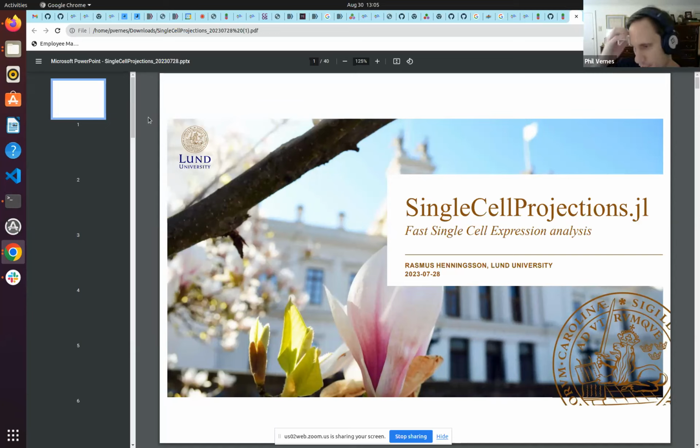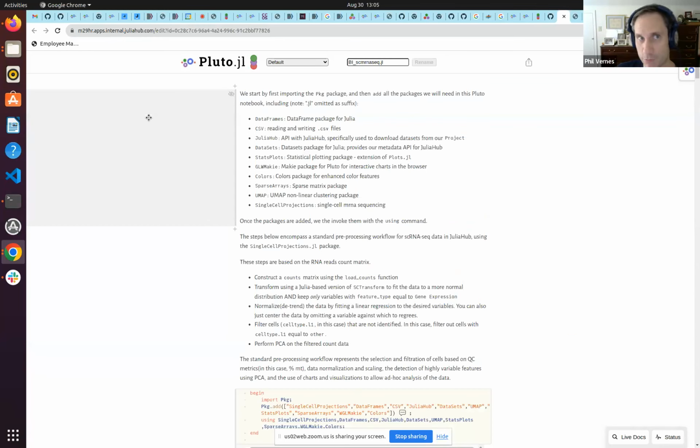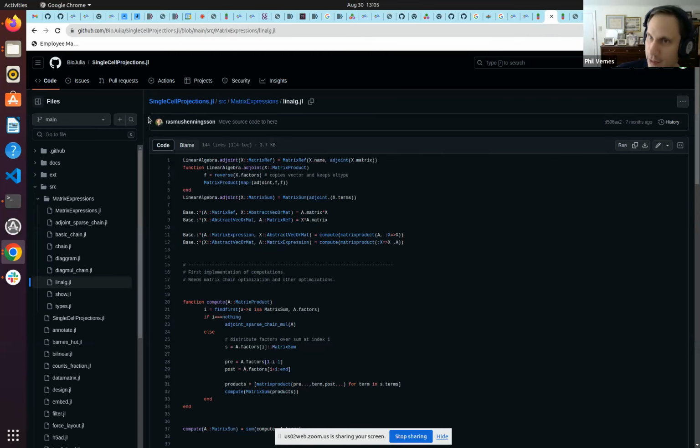So what's going to happen in the seminar is we're going to actually go through 3 different tabs. And the one I'm going to have the slides from the JuliaCon presentation, my live demo of the code, which is here in the Pluto notebook hosted in JuliaHub. And then at some points, we'll actually look at the GitHub repo very briefly, just superficially, so I can illustrate for the viewers here why it's well done, why there are particularly very strong patterns in this code.